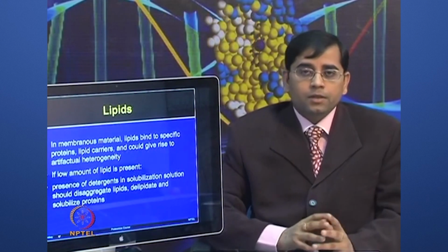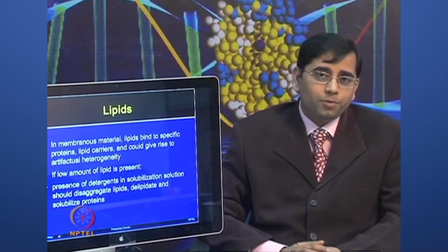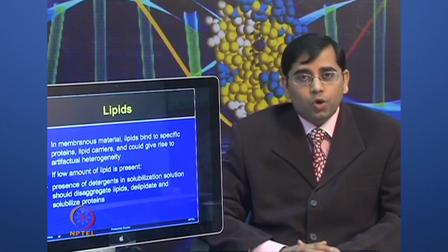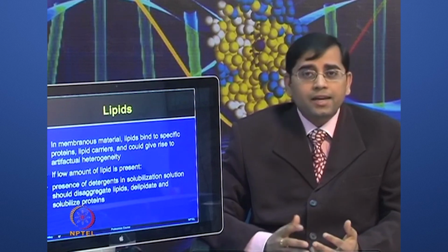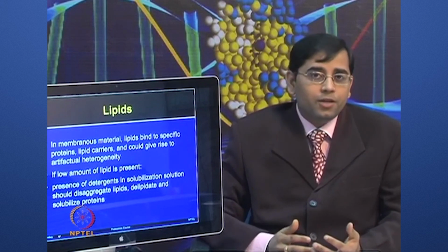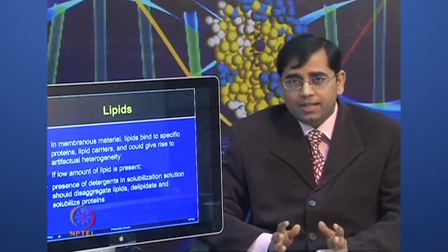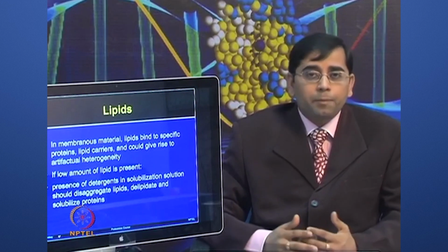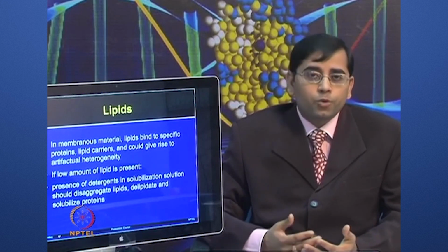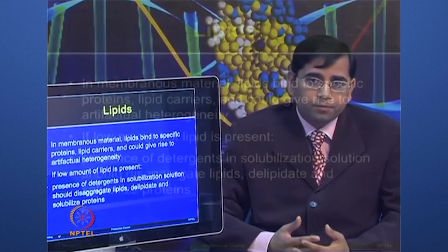Lipids are very important. They are used for various types of biological problems to probe, but if your context is to study proteins, you would like to get rid of any lipids or other nucleic acid or interfering components, because you just want to analyze only proteins. Since we are talking about sample preparation for proteomic applications, you would like to get rid of lipids.